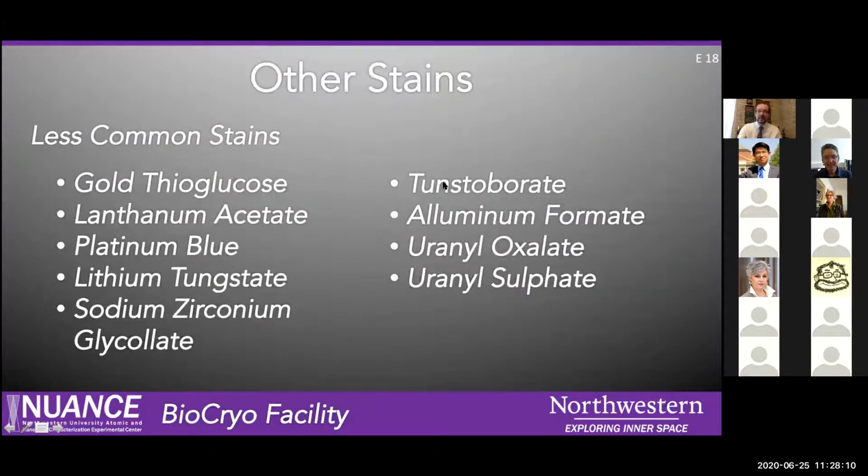Here we go. Okay, and just to mention, I'm not going to read off all of these, but there are so many other stains out there. So you really want to take that into consideration when you're doing your project. Take a look at the literature for maybe just your specific sample and really figure out what else is used out there besides uranyl acetate.